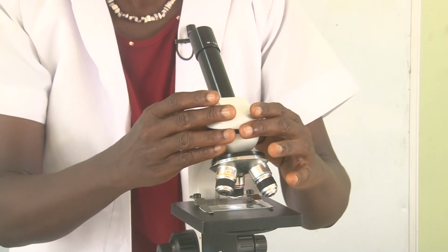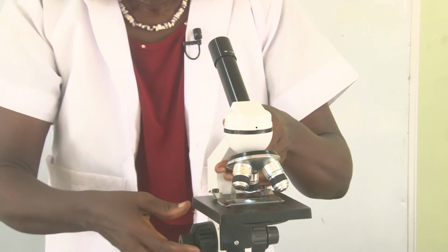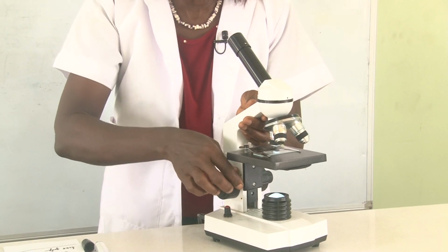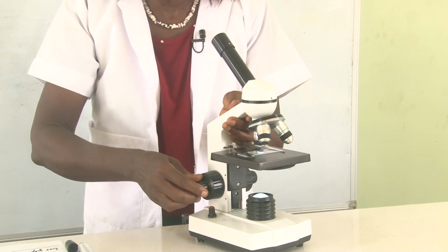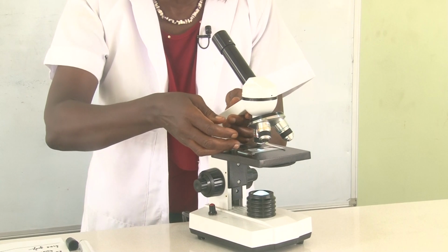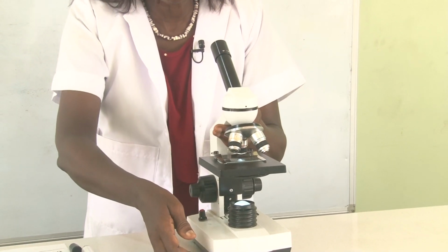This is just a tube. And you remember how we drew and showed the stand that holds them? We have the coarse adjustment knob that moves the stage. We have the fine adjustment knob also that moves the stage and moves the lenses closer or farther apart.